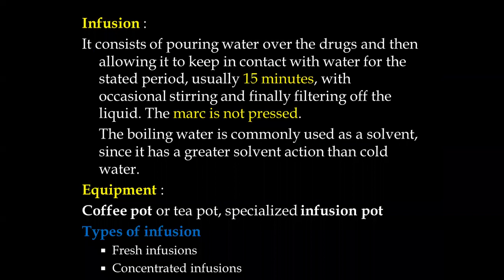So what do you mean by infusion? It consists of pouring water over the drugs, it may be the raw material, and then allowing it to keep in contact with water, or any other menstruum, for the stated period. Usually it will be 15 minutes with occasional stirring. And finally, based on the raw material, if filtering is required, you can go for filtering it. In certain cases the marc may be pressed, and in some cases in infusion, the marc should not be pressed.